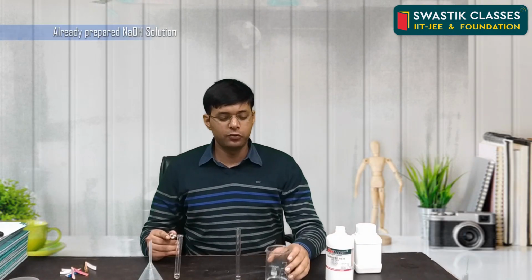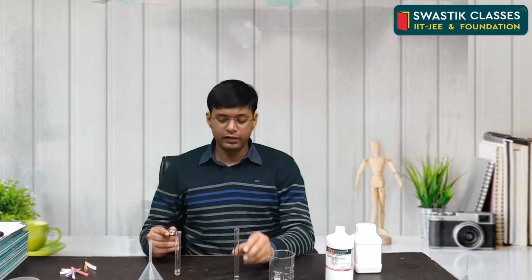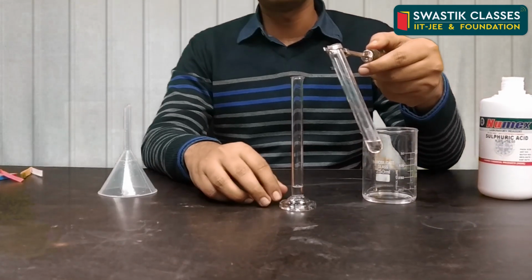I have taken NaOH from this earlier prepared sodium hydroxide solution to this graduated cylinder, and I have also taken a sample of H2SO4 solution, and I am going to add this solution in this graduated cylinder. And a neutralization reaction will occur.